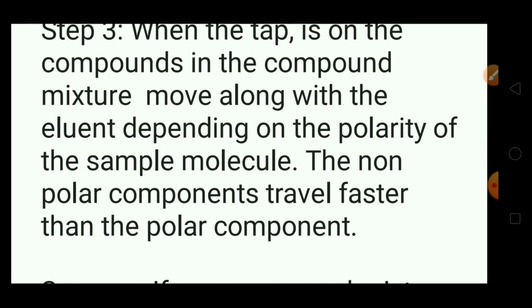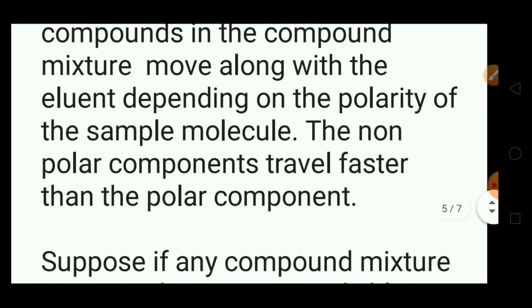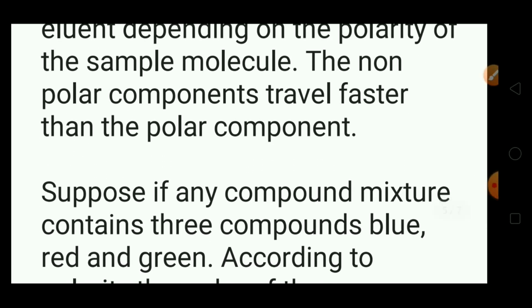Repeat it. The non-polar components travel faster than the polar components. Non-polar components travel faster compared to polar components.